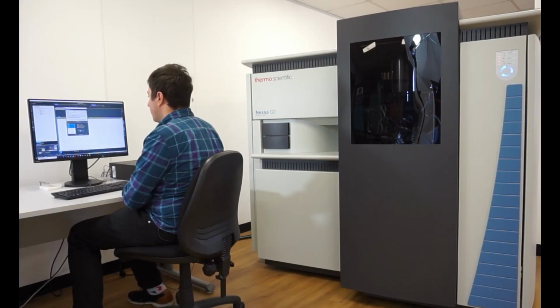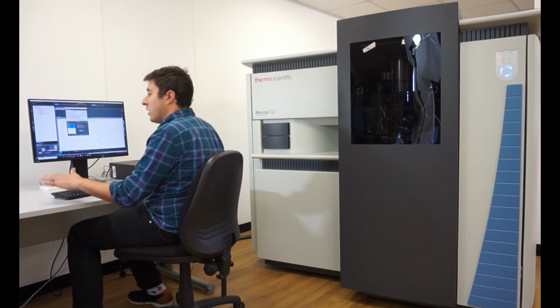So that suggests that not only has this sample not got really any sulfur left on the surface for a molybdenum disulfide, the surface itself, the coating, is not actually continuous. There's some variation on the surface as well. So that's something we can investigate a little bit further.